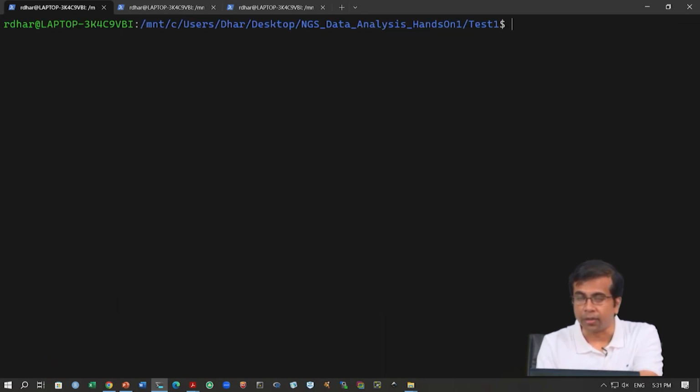All right. Once we have this, one of the things you will probably notice is that just calling them through this dot slash is actually quite cumbersome, right. Every time you have to direct them to the folder where they have been extracted. So, if you go out of this directory and go somewhere else in the system, you have to point to the directory where SAMtools has been extracted and call the command samtools. Is there any way you can call samtools from anywhere in the system? It turns out there is, right.